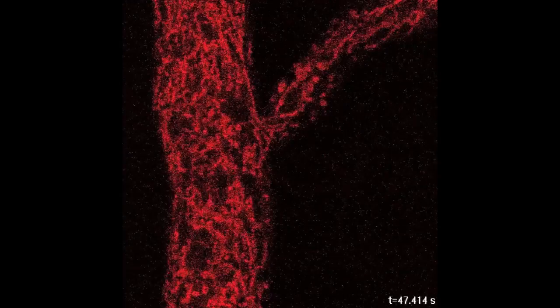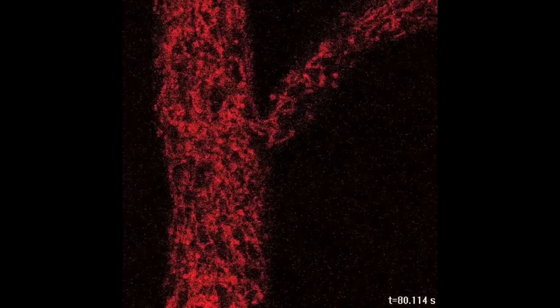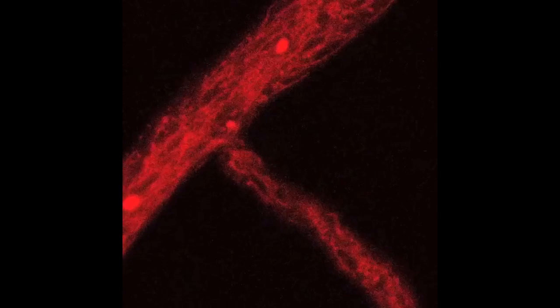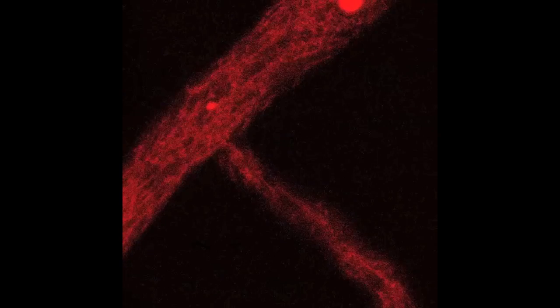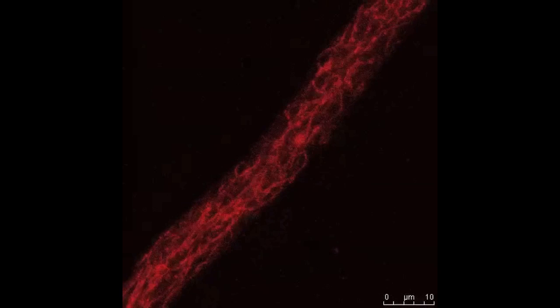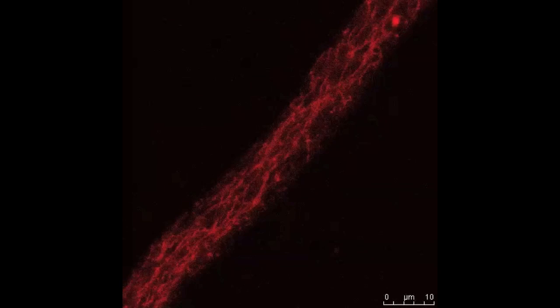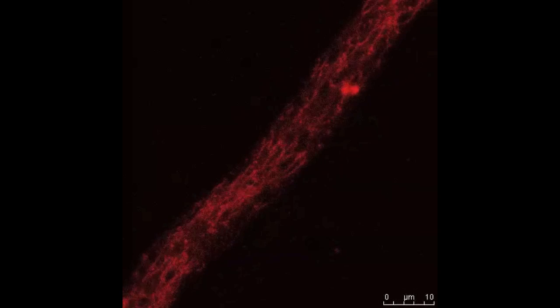50 to 100 microns behind the tip, the vacuolar proteins that we're looking at appear in a network of tubules, and these tubules are quite dynamic, with a whole network of tubules moving towards the growing tip. Occasionally, we'll see a small round vacuole embedded within this overall tubular network.